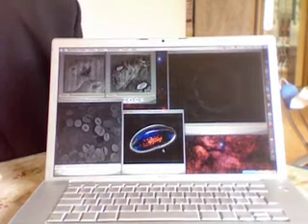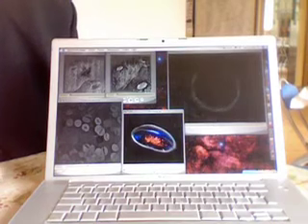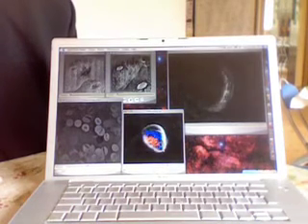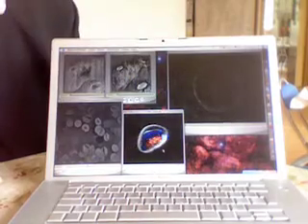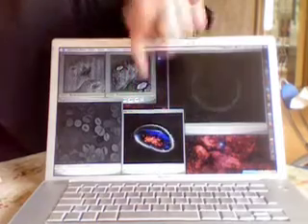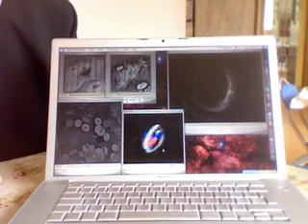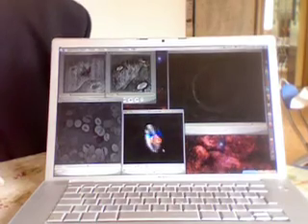Measuring the index of refraction gives access to another physical quantity, which is not available in current transmission microscopes. In this image, we made a false rendering in colors, and we can see different substructures, something which cannot be seen in a standard transmission microscope.